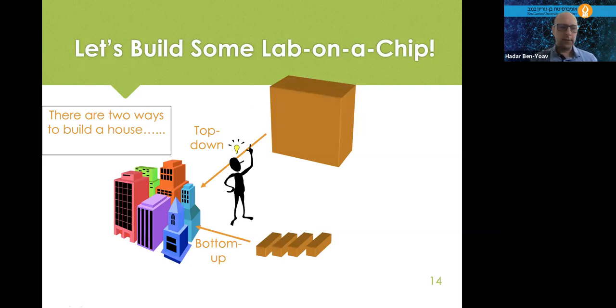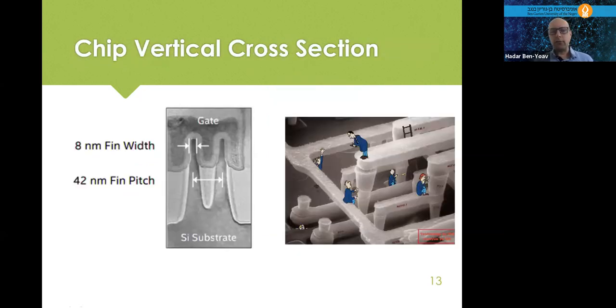So all this kind of development, and this is not a course about microelectronics production or fabrication methods, it's about lab-on-a-chip microfabrication methods. And the reason I show you all this development is that these tools that were developed for the semiconductor industry to manufacture processors and transistors and so forth, we as lab-on-a-chip scientists are able to utilize as a way to manufacture our own lab-on-a-chip devices.